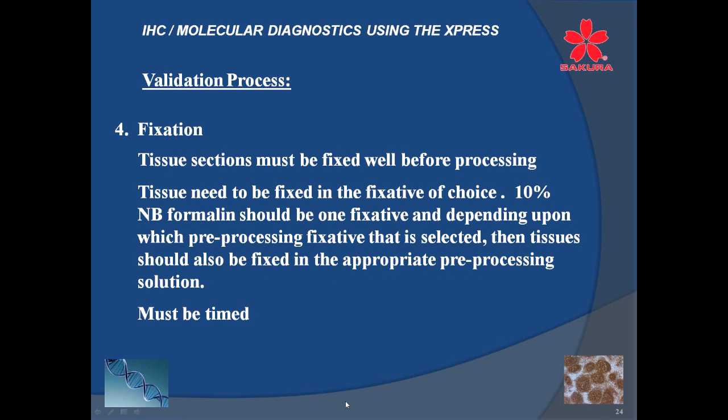Fixation then, tissues must be well fixed before processing. We try to adhere to those guidelines. I know that pathologists are wanting their slides out earlier, and more, we just keep pushing the time to get them on the processor. But depending on how well that specimen is fixed, it's going to give you the best results in the end. And I'd rather take a little more time up front than to have to go back and ask for more tissue or having to reprocess something because we let something fix very poorly.